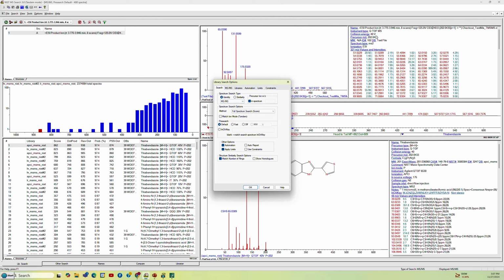Occasionally, when you import it for one reason or another, it will not have this precursor. And if it doesn't, just unclick the in spectrum, and then you can enter the value that you want for the precursor mass to charge to 3 or 4 significant figures. But in most of the cases in the Agilent search, it's correct. So I'll leave that checked. You can sort by different scoring systems, etc. You can set the MSMS tolerance. This is set at 100. Probably 10 might be a better place to put it for this instrument. That limits precursor and things that it finds in the library.